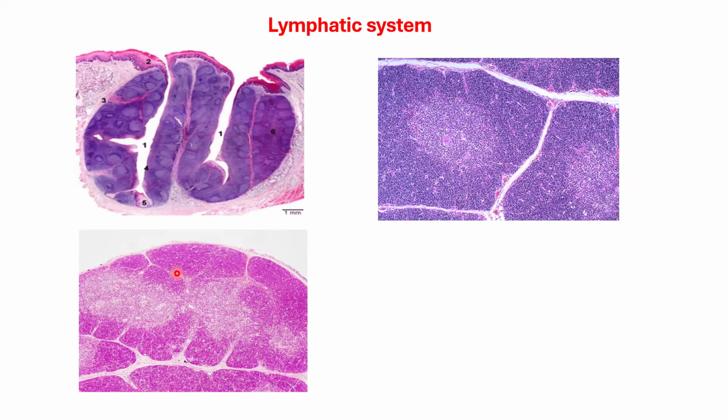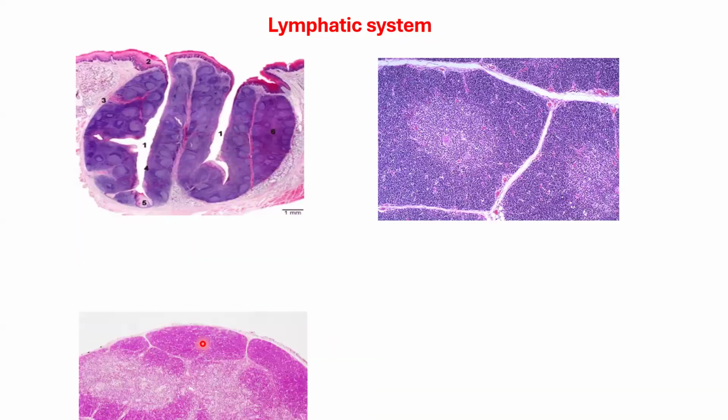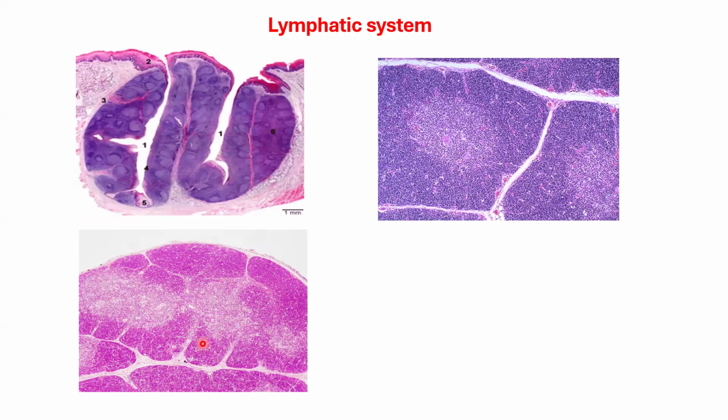These are now incomplete trabeculae. At this point now, for the spleen, remember it won't be that clear, but this now is the region around the red part, then the white part will be around here. But the correct image that I would like us to get is this. This comes a lot in exams. So for this, there's a spleen.